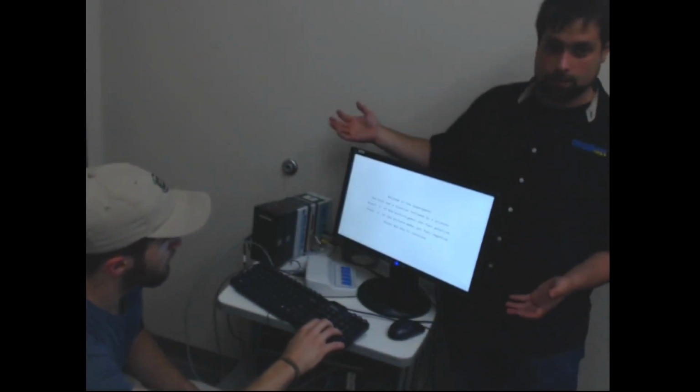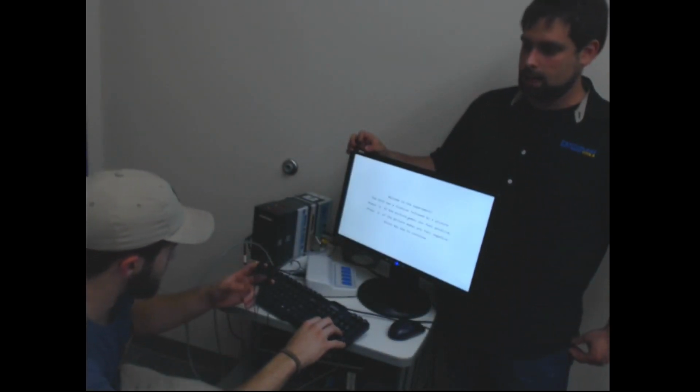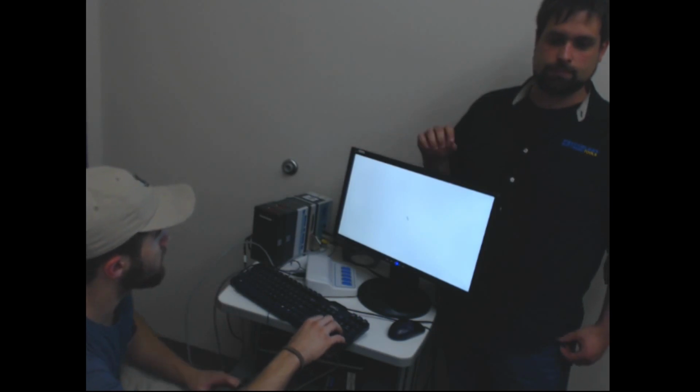So what I'm going to do is start acquisition here, and then I'm going to start the experiment and have Cade run through it very quickly. Start recording on Biopac. I'm going to start recording on E-Prime, and I'm just going to let Cade go through and run the task. Is it 2 or okay? Yeah, it's 1 and 2. 1 and 2. Okay, cool.